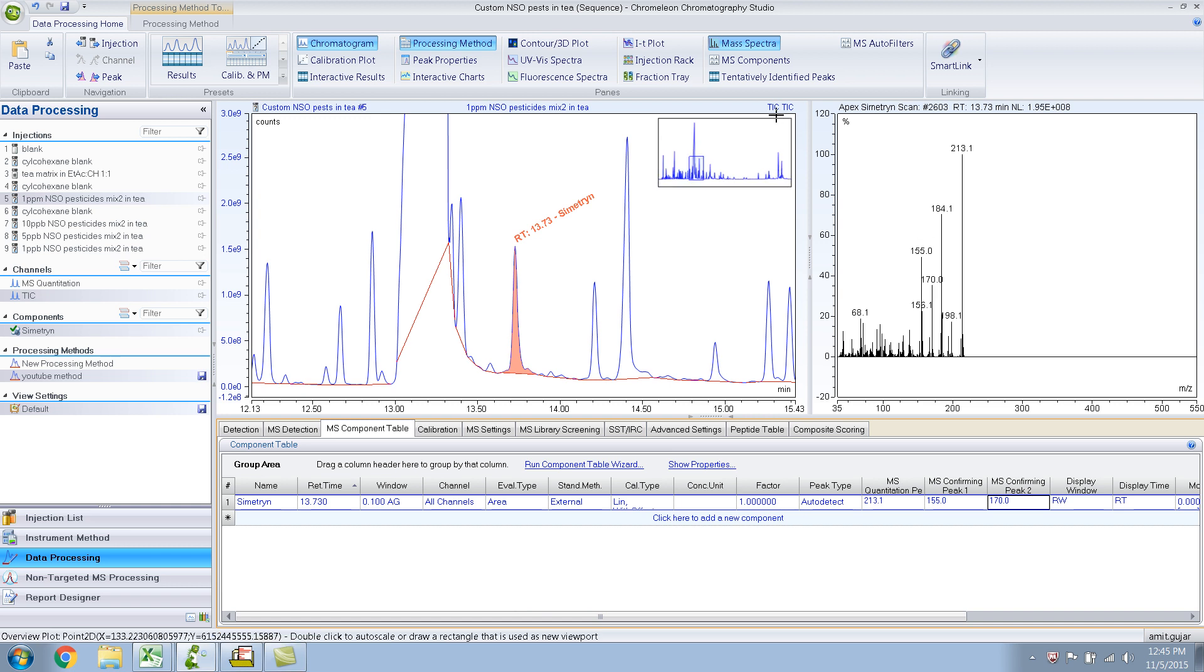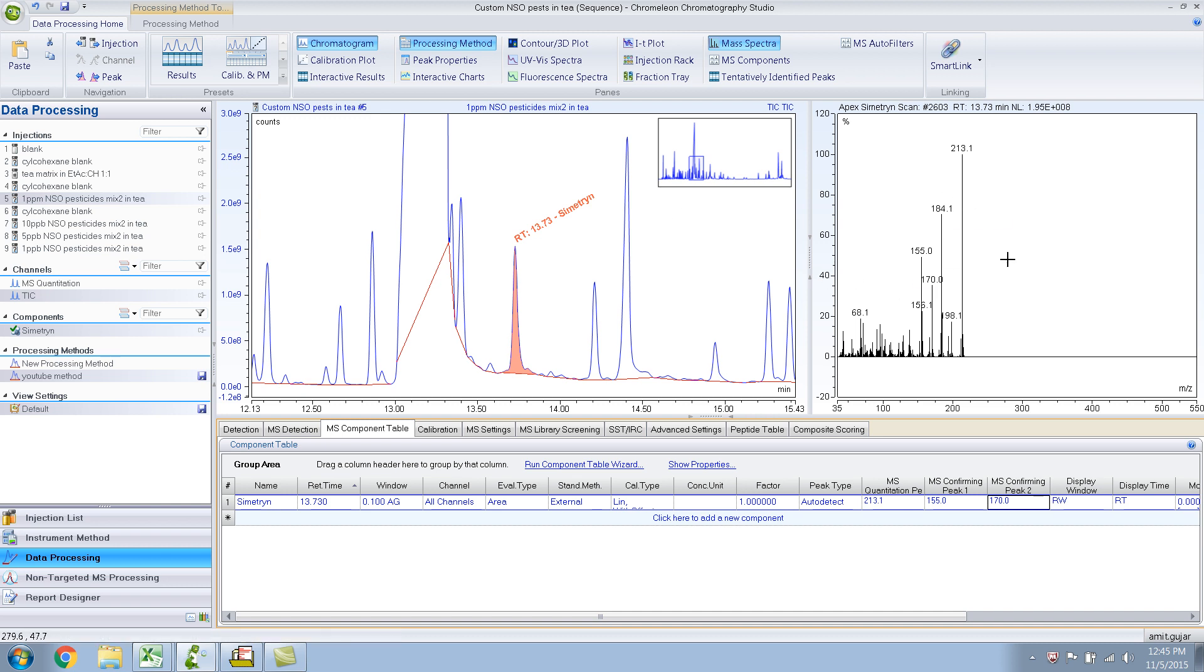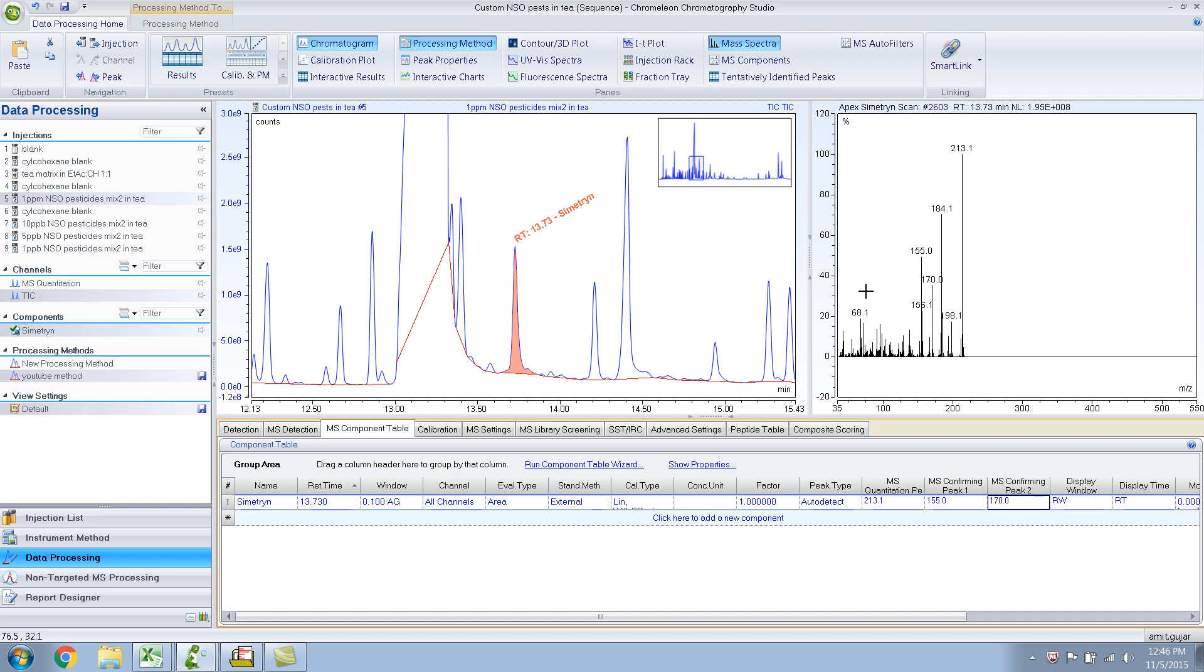You should not quantitate on the total ion chromatogram because if you would have quantitated on the TIC, you would have got wrong results. You would have added results for 184 into your symmetry results basically.